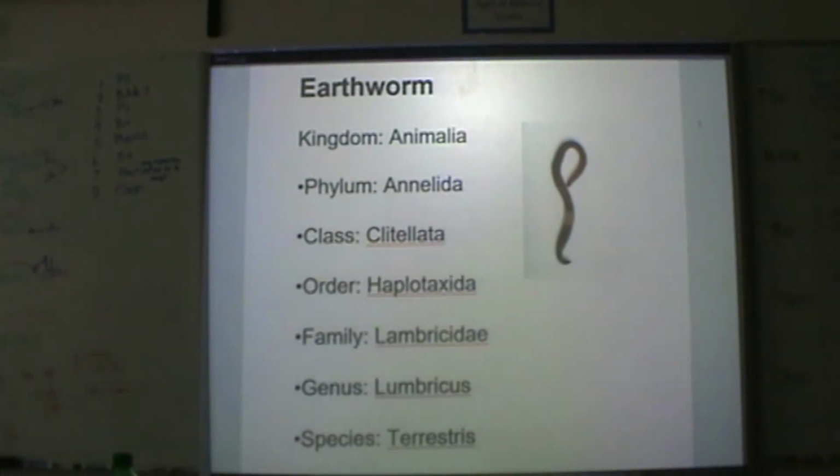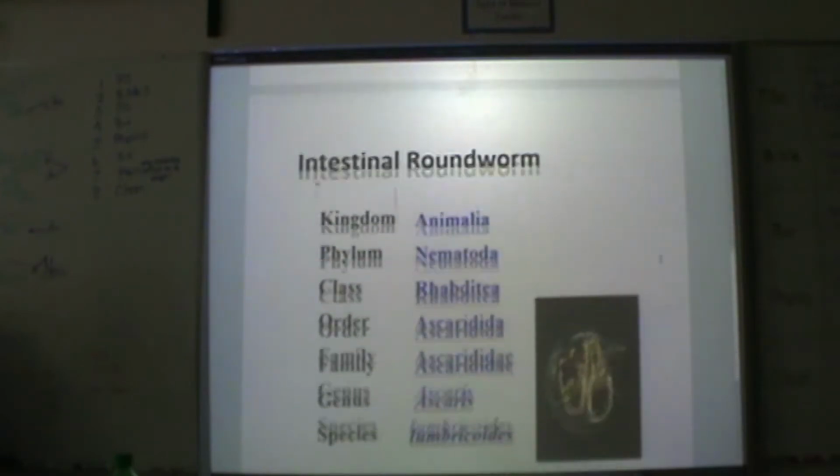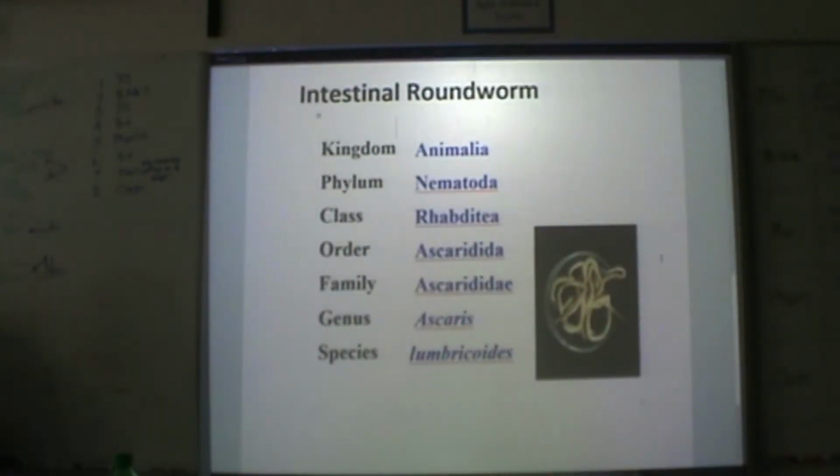And for the other one, the ascaris, there is the classification as you go down, and we'll start with the ascaris as far as the dissection. You will download both of the sheets, and as you go through and watch this, then they will help you fill them out.